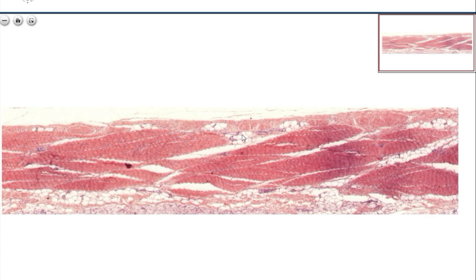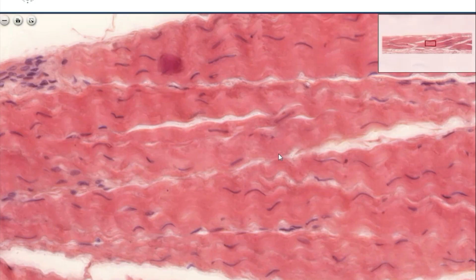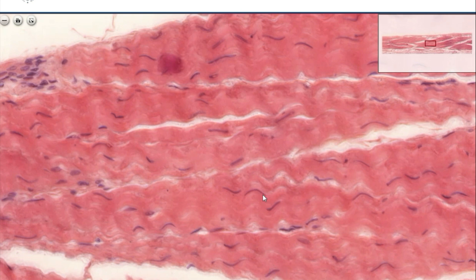The main part of the slide shows dense collagenous connective tissue with HND staining. If you enlarge the slide, you see the thick bundles of collagen fibers. They are wavy because of the shrinkage due to the fixation. Between the fibers, the narrow blue lines are the fibrocytes. These fibrocytes have very thin and compact nuclei and practically no cytoplasm.